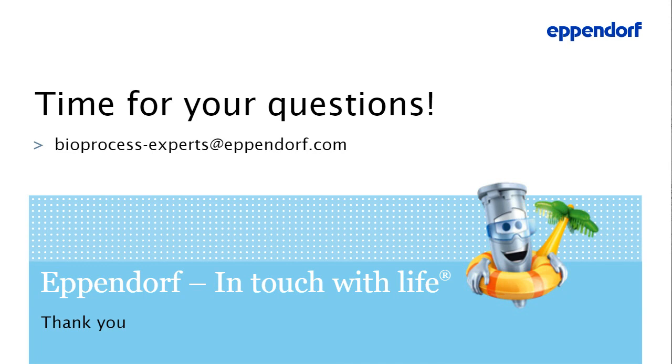The next question is, how long does the sensor calibration take for setting up a bioreactor? Does this have to be repeated for every batch setup? If you're working with standard ISM or analog sensors, depending on the type of the sensor that you're working with, you could look at anywhere from 2 to 6 hours of polarization prior to the calibration. I would also recommend that you always change the electrolyte solution prior to each run if you're working with a polarographic sensor. In theory, you just need to do this occasionally, but it's a better practice to check it every time before you set up your vessel.